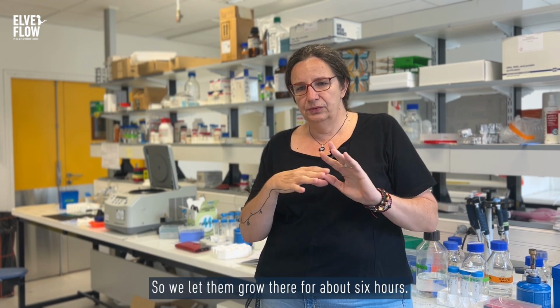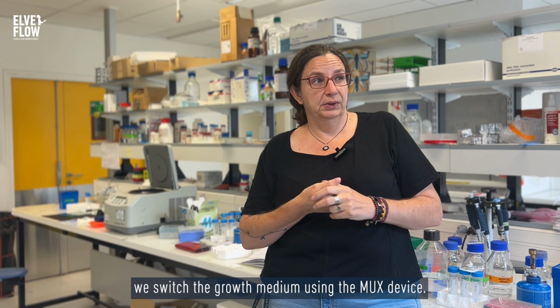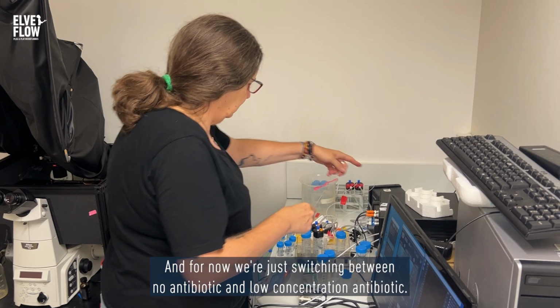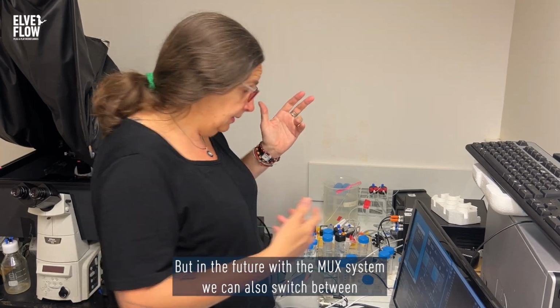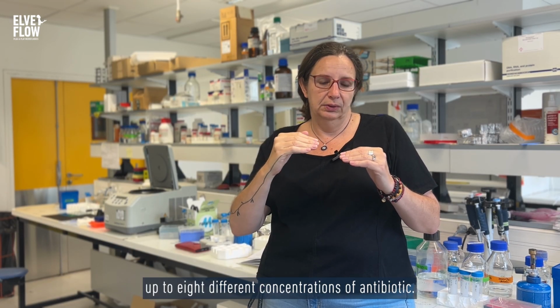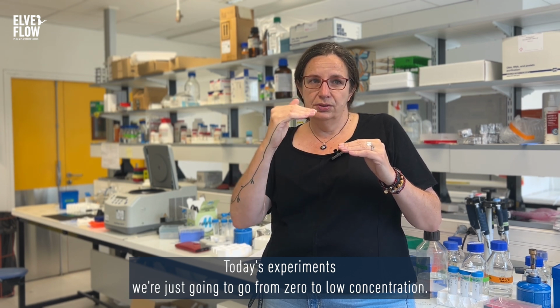So we let them grow there for about 6 hours, and then we switch the growth medium using the MUX device. And for now, we're just switching between no antibiotic and low concentration antibiotic. But in the future, with the MUX system, we can also switch between up to 8 different concentrations of antibiotic. Today's experiments, we're just going to go from 0 to low concentration.